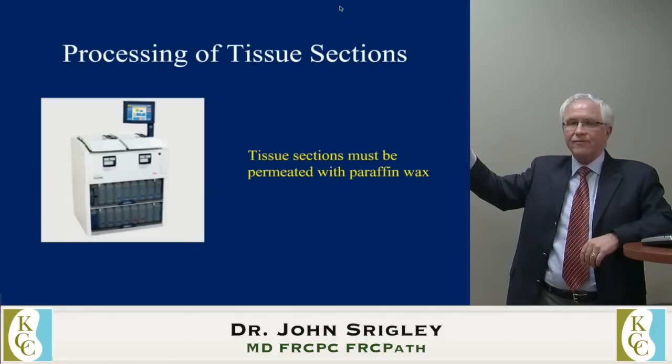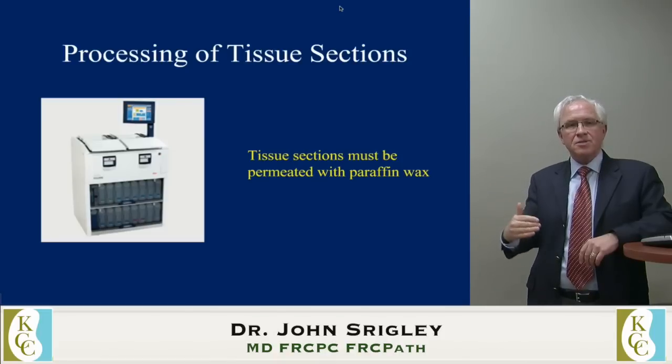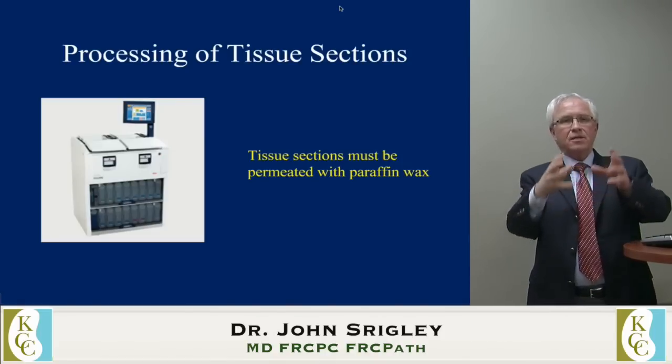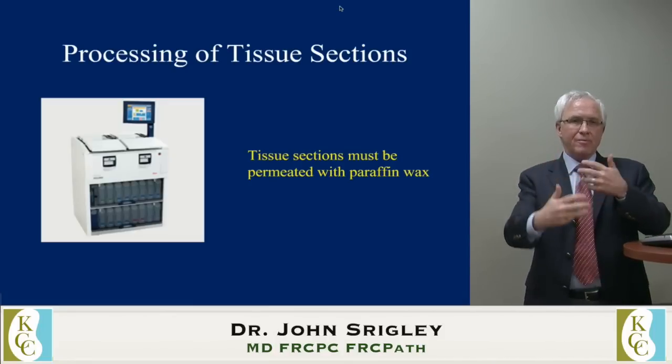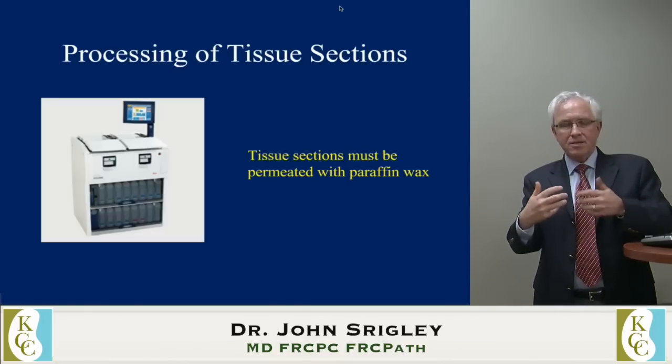So this is just an instrument here for processing the tissue. And this is a process that usually occurs over a night. So we'd put all these blocks on the processor in the evening, and then they'd be ready the next day. All the tissue would be permeated with the wax, and they'd be ready to be cut.